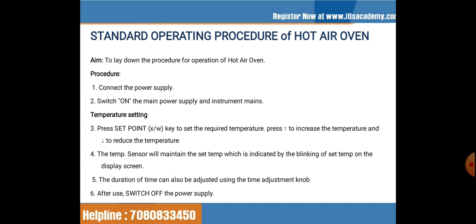The temperature sensor will maintain the set temperature, which is indicated by the blinking of set temperature on the display screen. The duration of time can also be adjusted using the time adjustment knob. Then, after use, switch off the power supply.